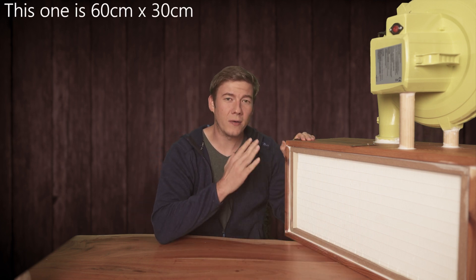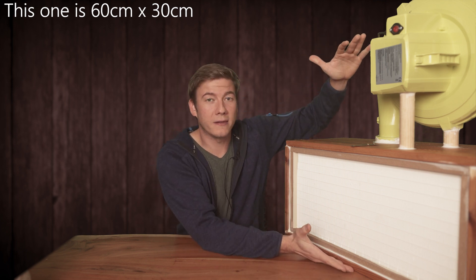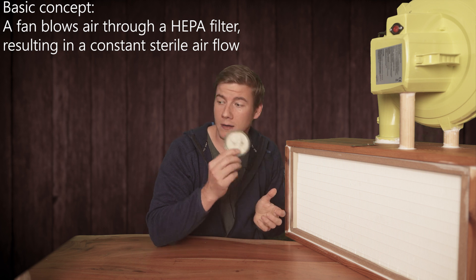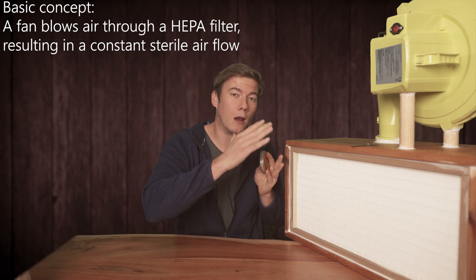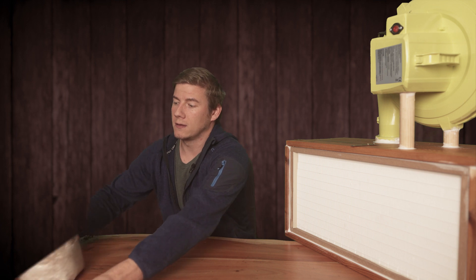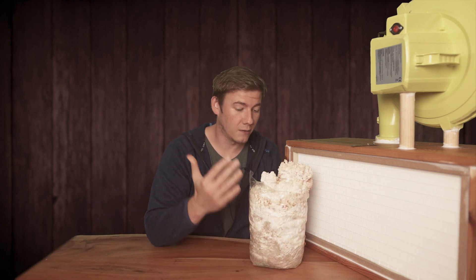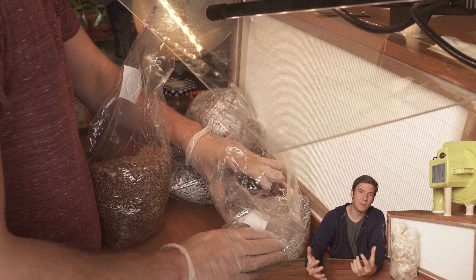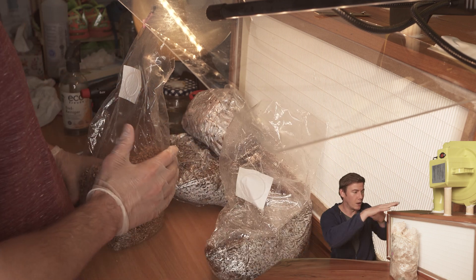The first thing we have to ask ourselves is how big shall our laminar flow hood be at the end. That is very important because when we double the size of the laminar flow hood we need a lot more power to push the air through the filter, and more power means it will be a lot more expensive. So if you just plan to work with agar and petri dishes we can build it a lot cheaper, but when you also think of inoculating spawn you need to think how big the setup should be so that you'll be satisfied working with it.